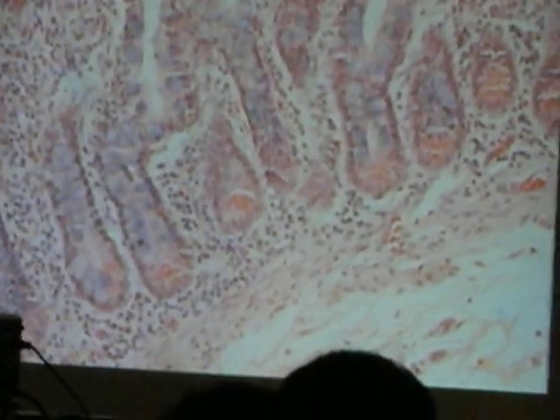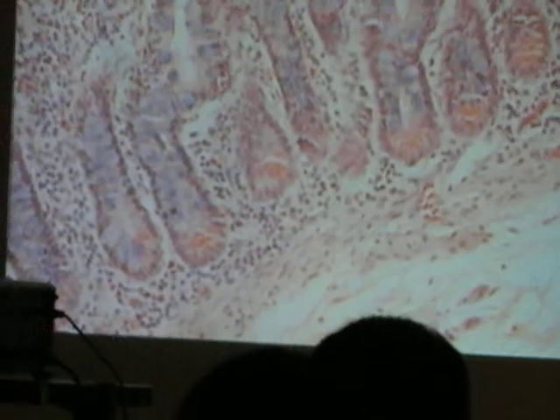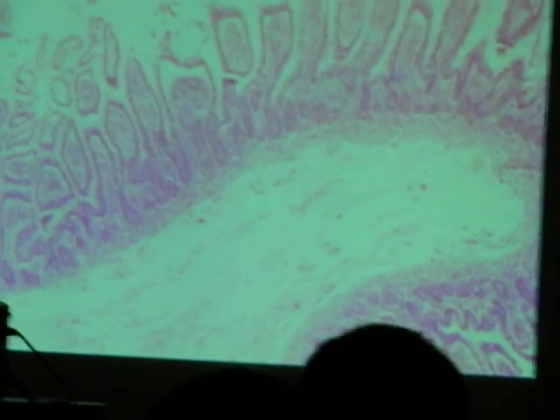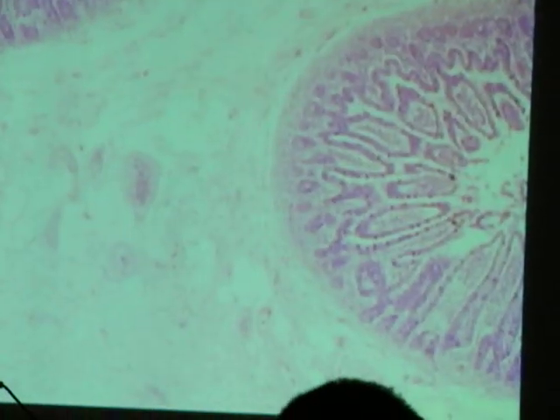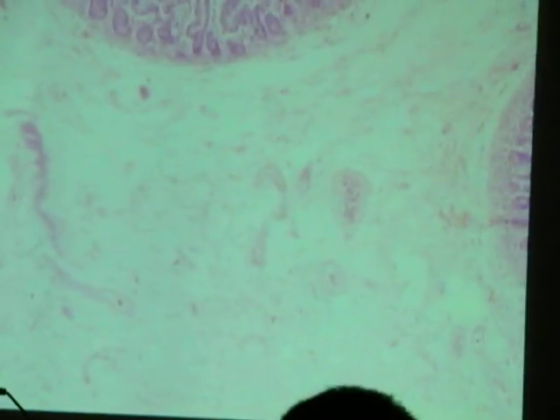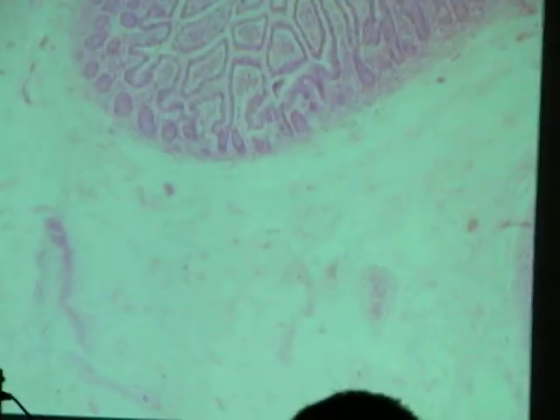Now, for the muscularis externa layer, similar to other slides, there are going to be two muscle layers you're going to need to know. So here they are. All of this outer stuff here, that's the serosa.